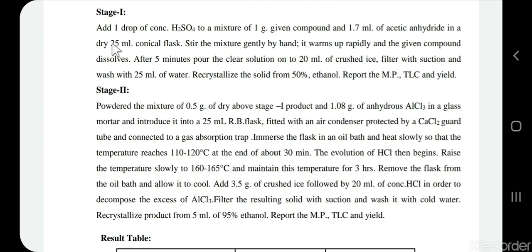Stage 1 is now complete. We need to dry the compound very well and also dry the apparatus, because in Stage 2 we are going to use AlCl₃, which is very sensitive to moisture — it reacts violently with water. We powder 0.5 gram of the Stage 1 diacetate compound and add 1.08 gram of anhydrous AlCl₃ into a 25 ml round-bottom flask fitted with an air condenser and a guard tube filled with calcium chloride to protect AlCl₃ from moisture.